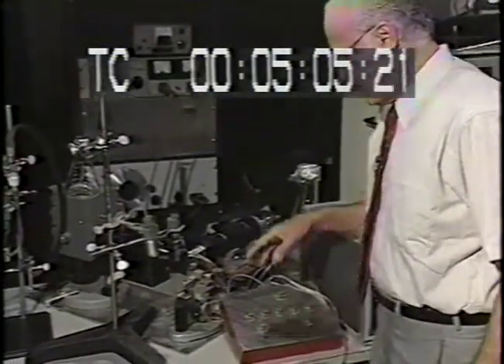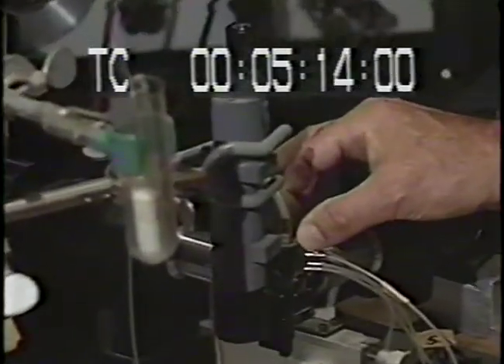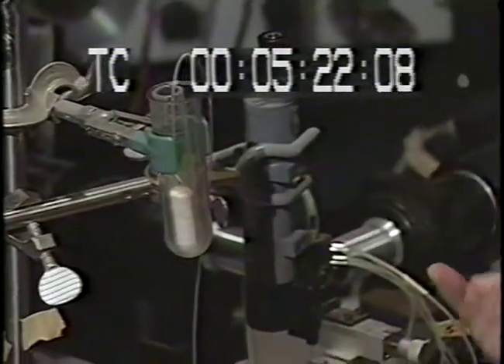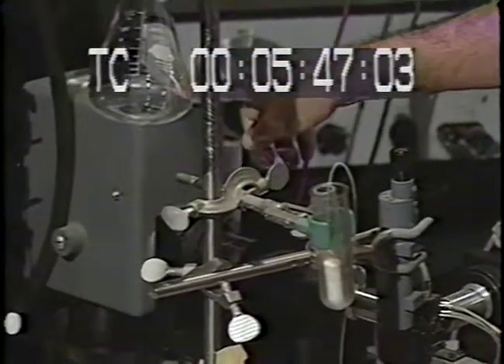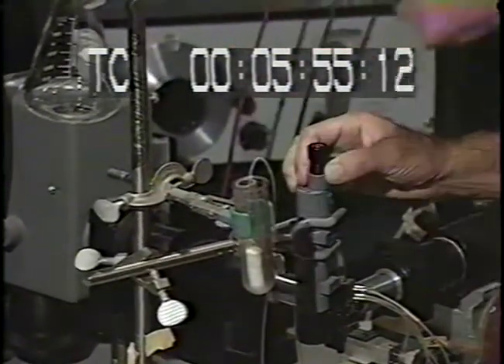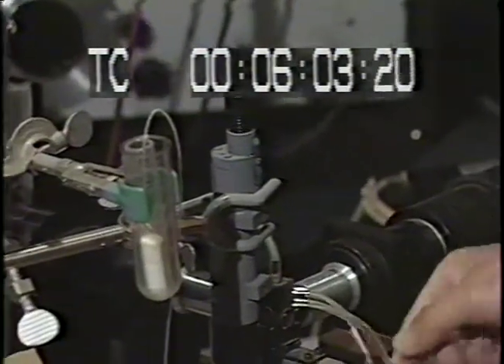The functional part, the most important part of the instrument is here. This is the chamber of the instrument where the cells flow. They are contained in this tube here, and they flow from underneath the chamber. Then there is a water reservoir that feeds the outer sheath, as it's called, that goes around the cells and flows upwards. Here is a mercury arc lamp that illuminates the chamber, and one uses this microscope to see the intersection of the cell flow and the light, and uses this crude mechanism to center it.